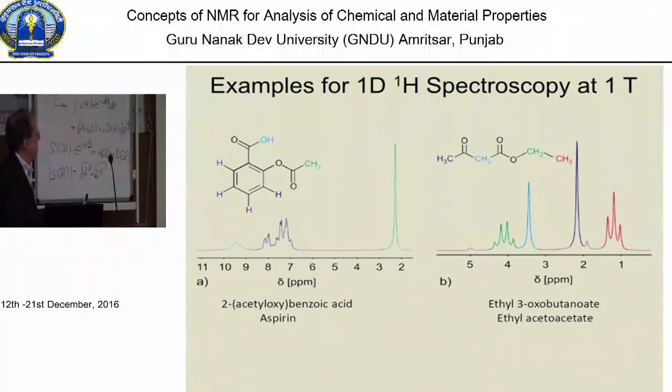So this is probably one line which identifies that CH2 group as this peak over here, and the CH3 group over here, also doesn't couple to anybody else, except maybe a weak coupling to the CH2 group, but it has to be at low ppm value, so that's that CH3 group, while this one here shows couplings, so that is split, and it must be this one, and that couples to this one, so the CH2 group here must be that one. So this is a relatively straightforward analysis you can do by inspection of a one-dimensional spectrum.